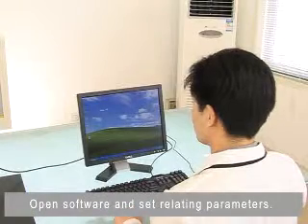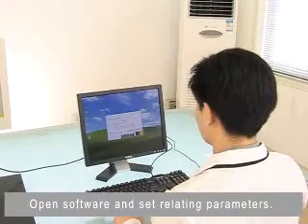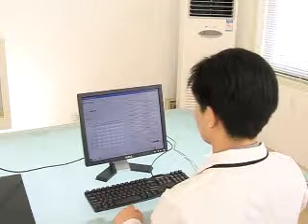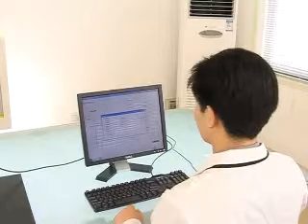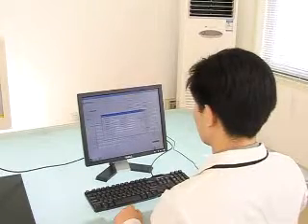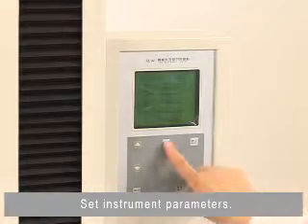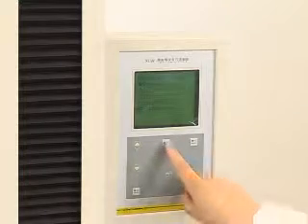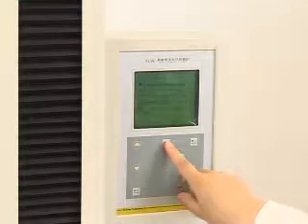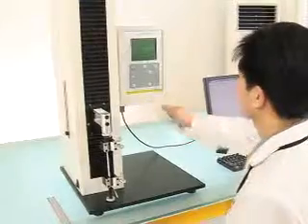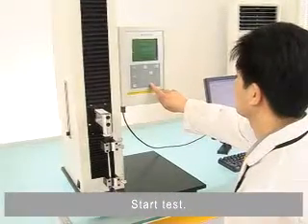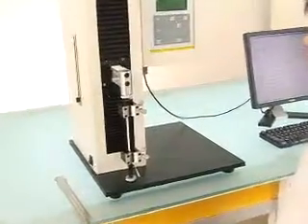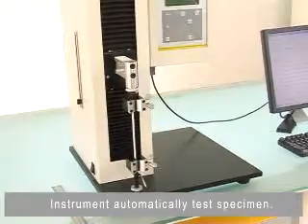Open the software and set the relating parameters. Set instrument parameters. Start the test. The instrument automatically tests the specimen.